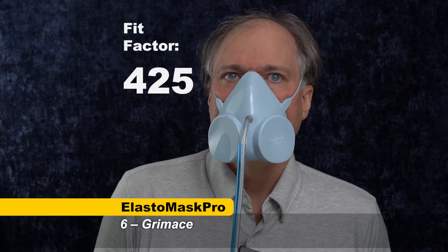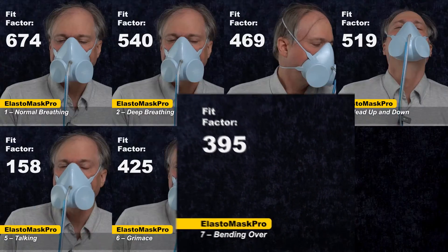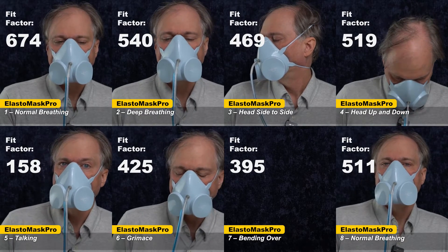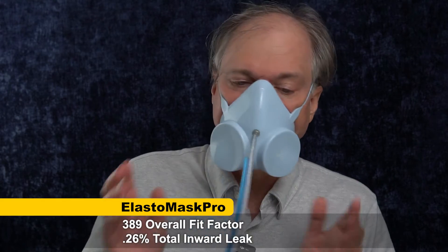The grimace is a smile or a frown — the test is to see if the mask resets after you've done that. Bending over, the weight of the mask can pull it away from your face. And finally, back to normal breathing. Then we get the overall score after all of these individual scores. Wow — 389 overall fit factor. Outstanding score for an N95 level mask. It fits really well, even through all those different exercises.